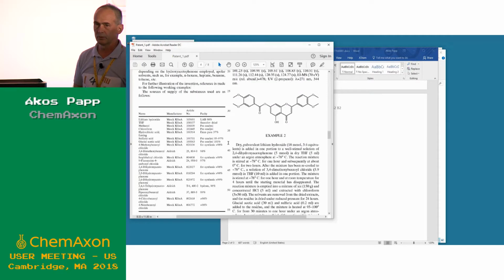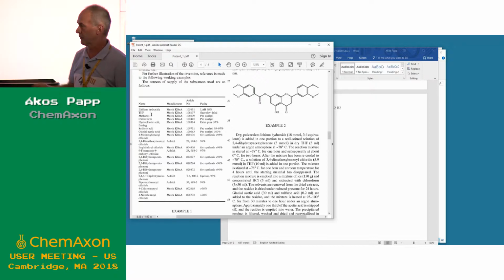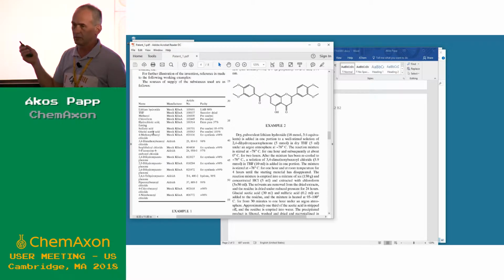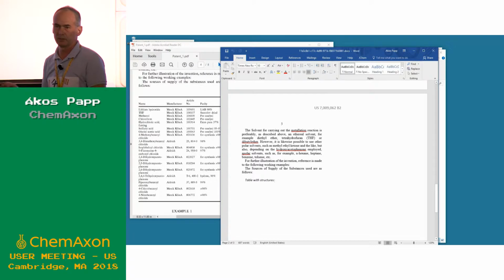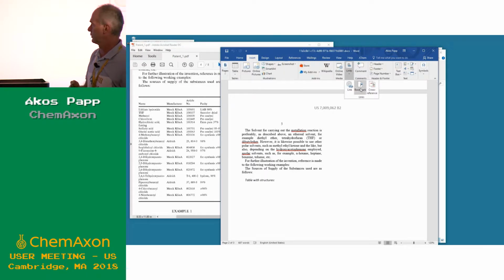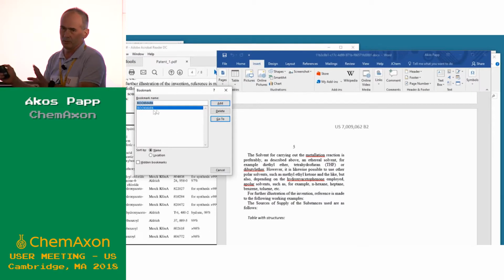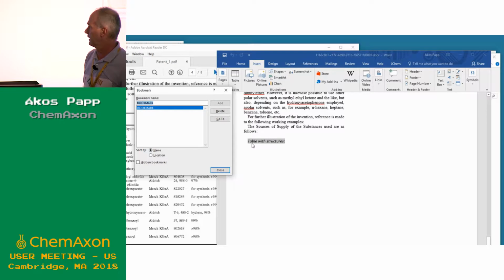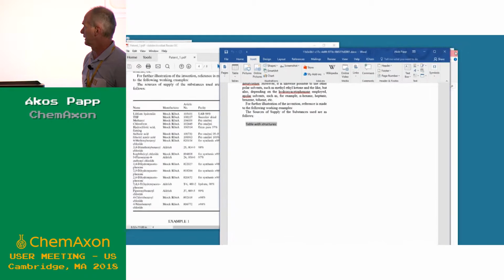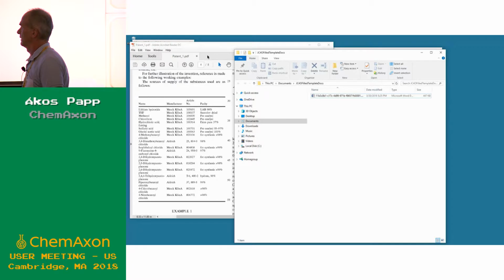We still need to load examples. And in this document, this is a spreadsheet with some names, but I will show that even structures can be inserted in such a table. So structures, data. So we have one more bookmark that remained. So the first two were deleted and replaced with the content. And this one I just called bookmark. This is where the table will be placed. Of course, it can be specified using the API what should be replaced with the test writer interface.